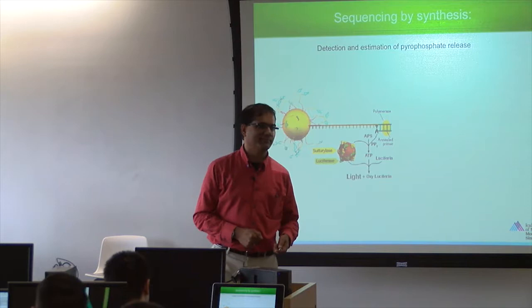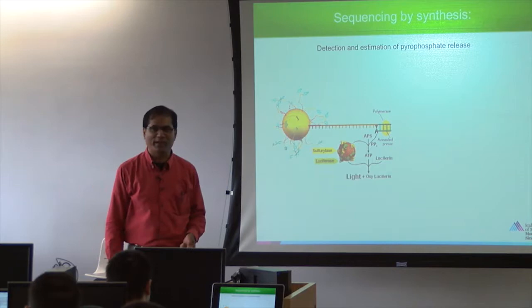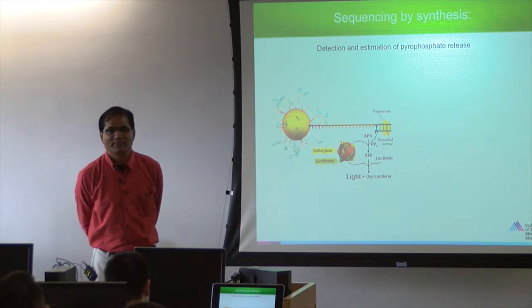Wash everything. Remove the whole thing now. Now add GTP, dGTP. Keep on adding and keep on extending this. Isn't it cool?